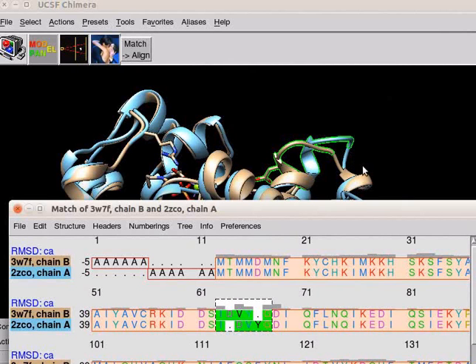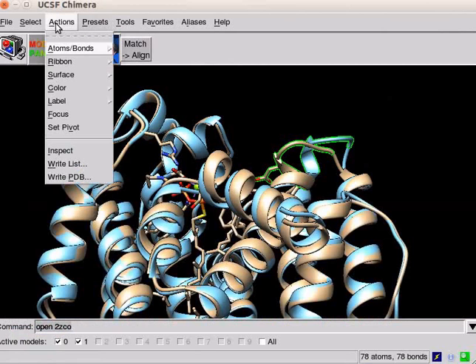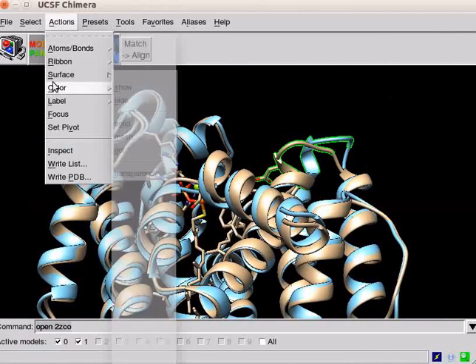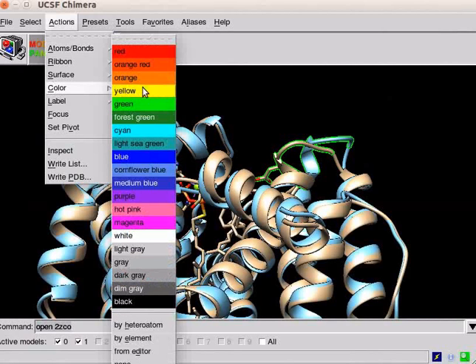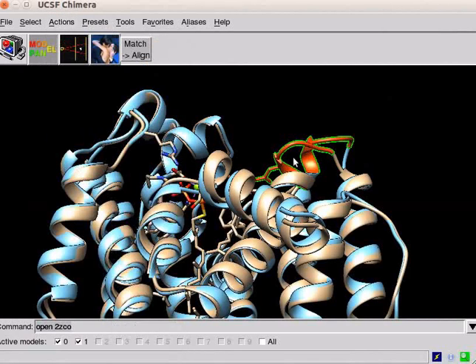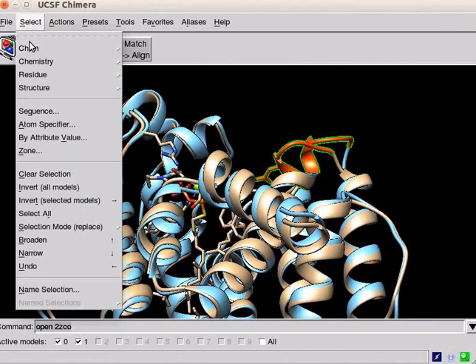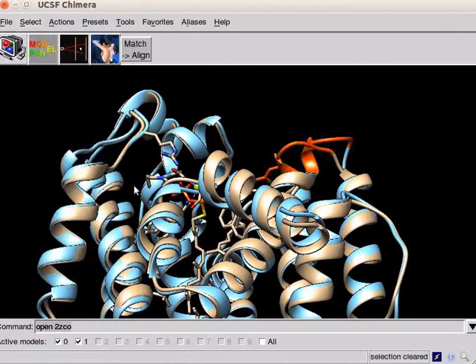You can change the color of this non-superimposable part using actions menu. Click on actions menu. Scroll down to color. Click on orange red option. Now, this part is highlighted.